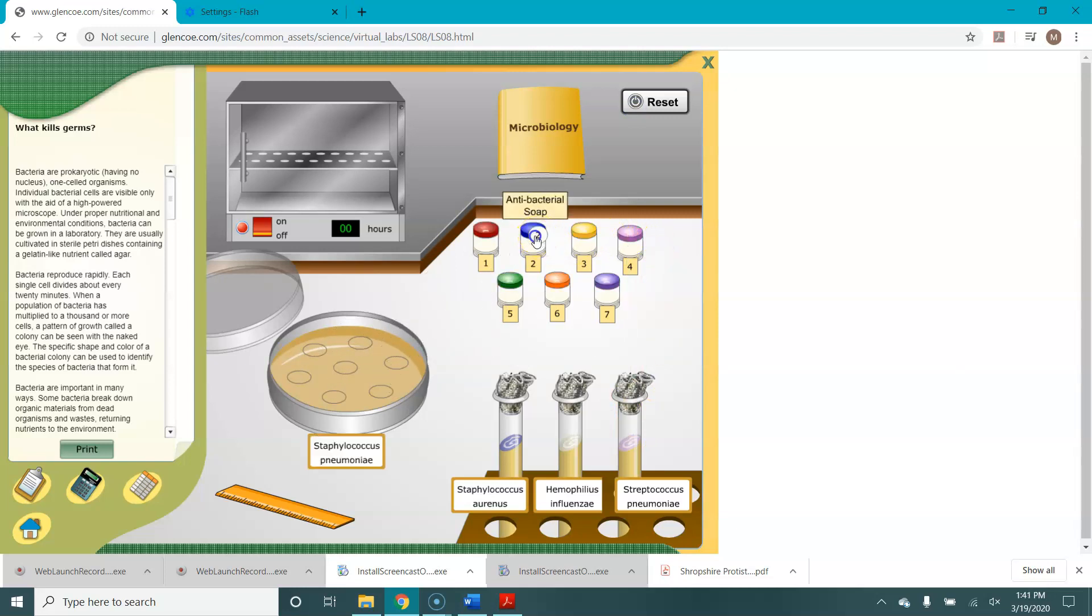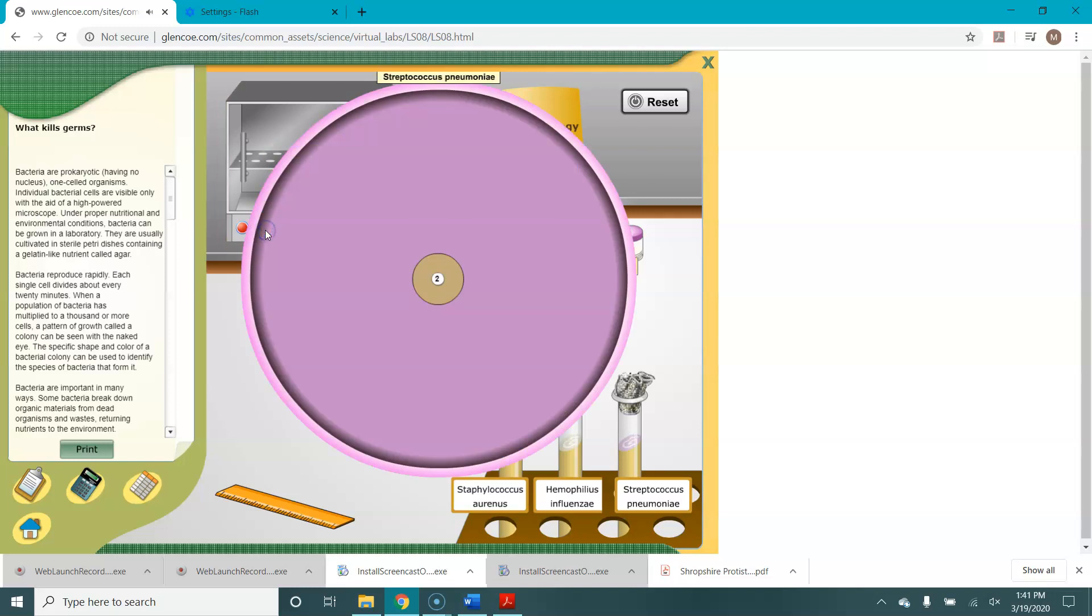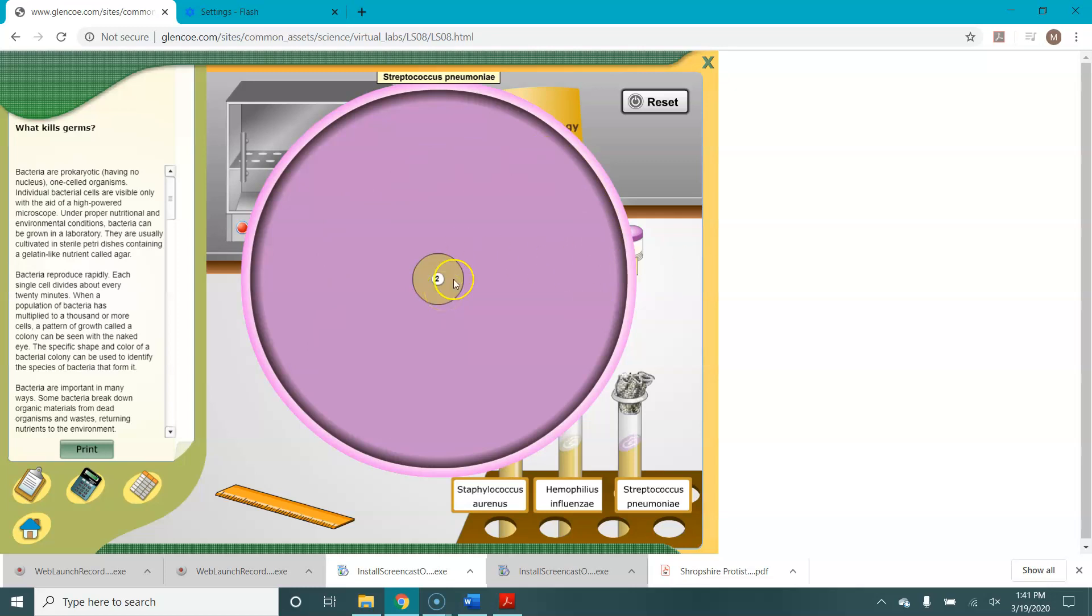So we've got our lawn. Let's put some soap on, incubate it, bring it back out. So our lawn for Streptococcus pneumoniae, at least in this virtual lab, looks like kind of a light lavender mauve color, and the zone of inhibition is still tan.